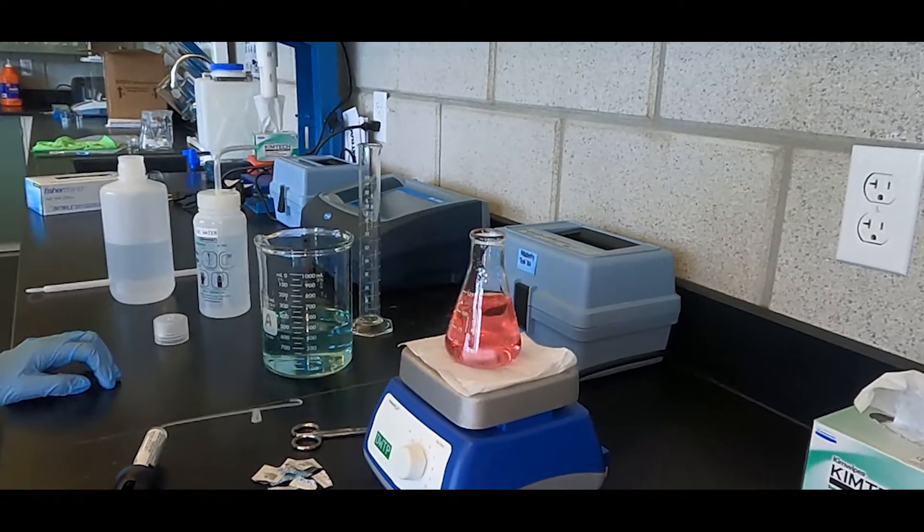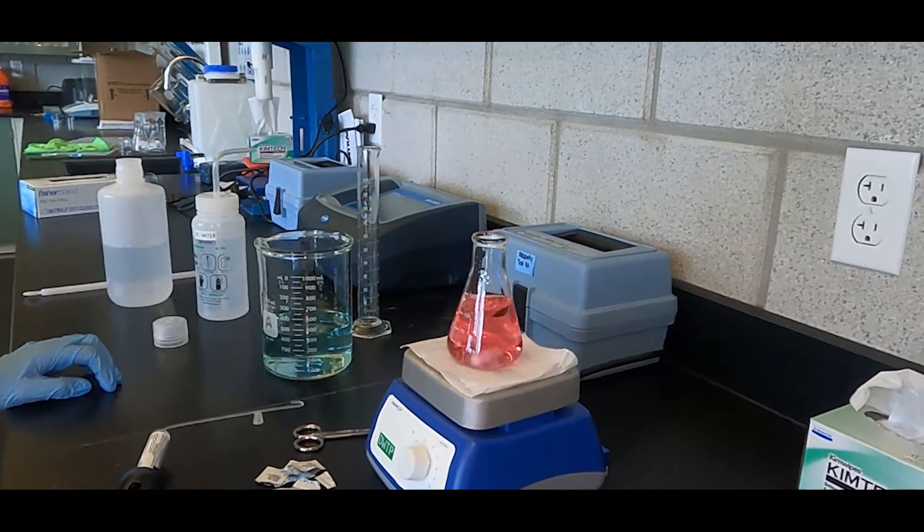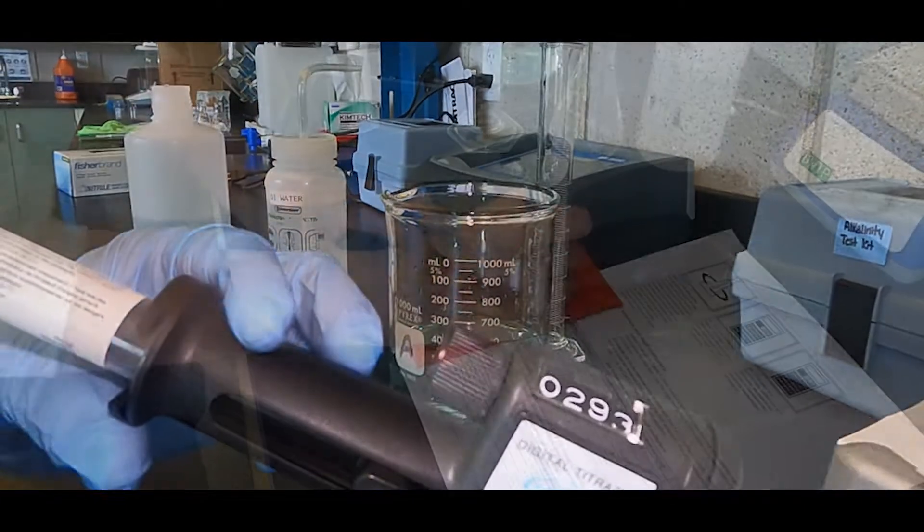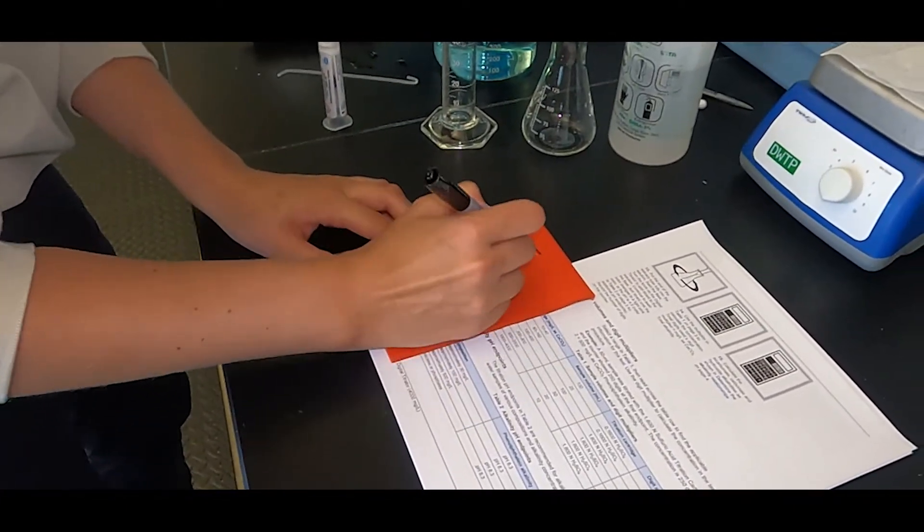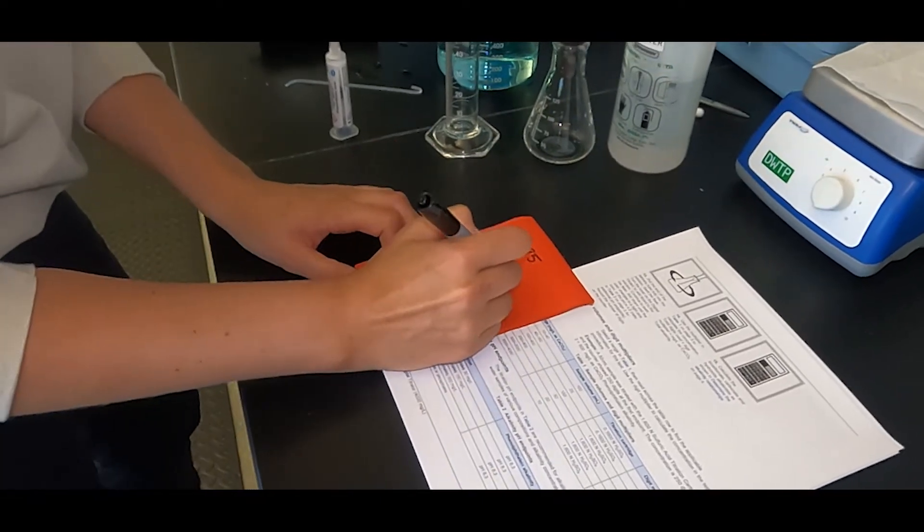Record the final value displayed on the digital titrator. This is your total alkalinity reading. Use the multiplier in the table to calculate the concentration as milligrams per liter of calcium carbonate.